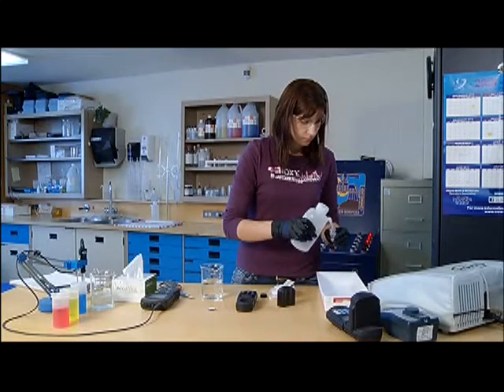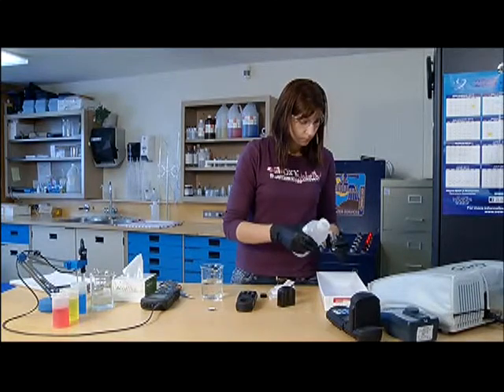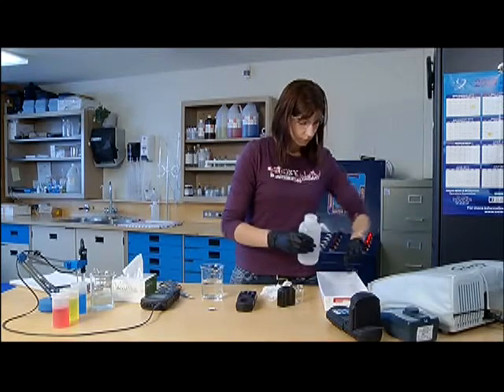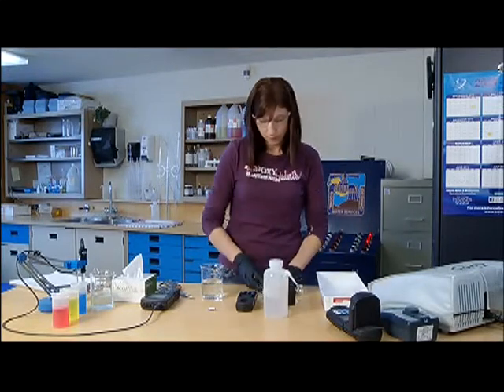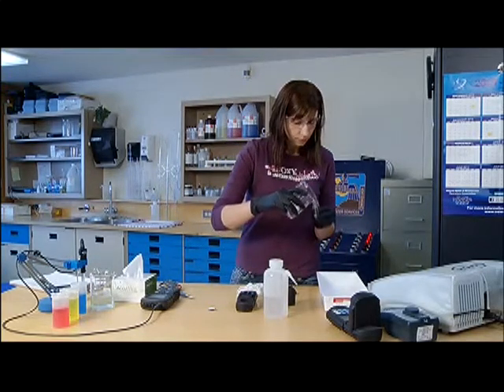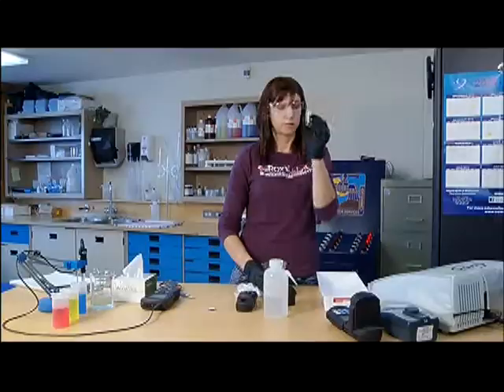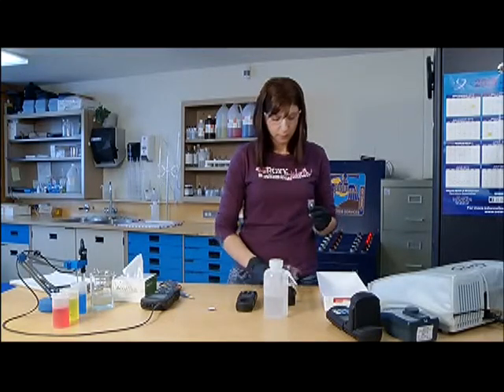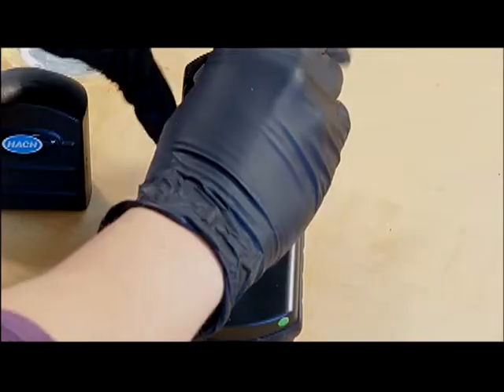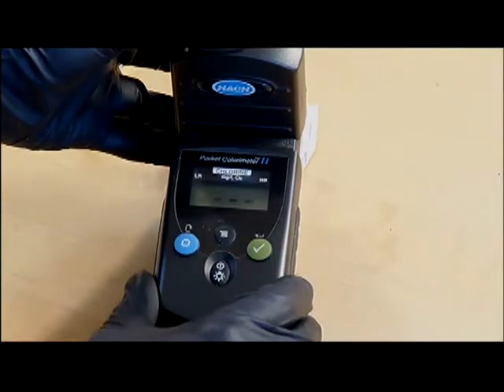In between the free and total chlorine samples, rinse the vial three times again with pure water to avoid introducing contamination. Remember to rinse the vial lid too. Fill the sample to the designated sample line on the vial, as it is a pre-measured amount of water sample for the pre-measured reagent in the pillow packet.